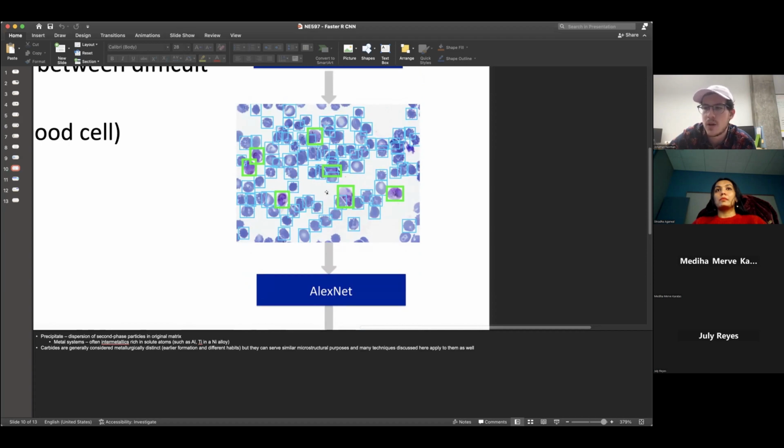And when you're analyzing bubbles, it really is a binary. Is this a bubble or is this not a bubble? So if we're treating it analogously, I think that just applying faster RCNN for bubble identification would be more than sufficient, because it's very good at that. Yeah, so you would directly apply, right?